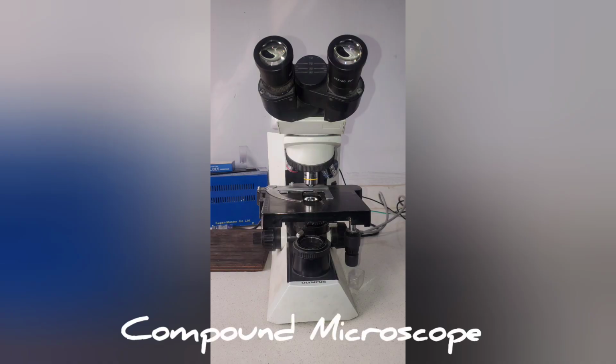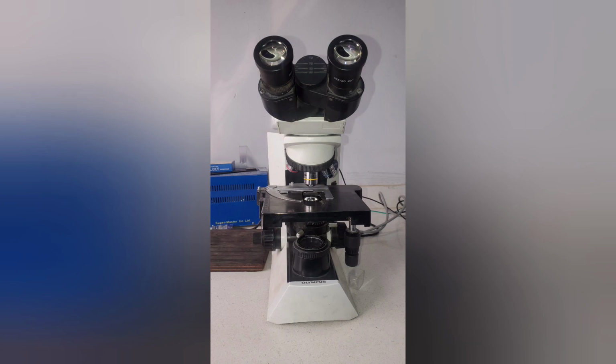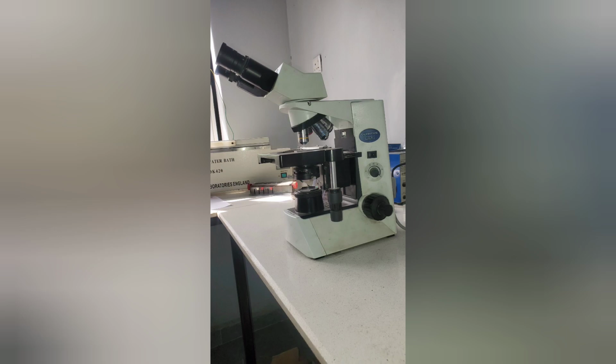Now, the compound microscope uses multiple sets of lenses. This microscope has a higher magnifying power. It can magnify up to 4 times, 10 times, and 100 times. And this microscope uses light. Sometimes it is called a light microscope.